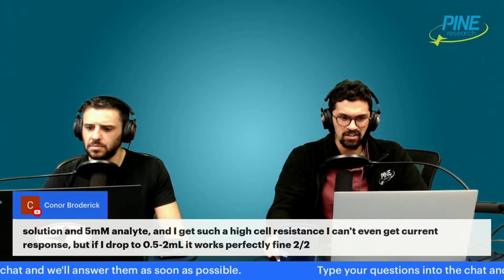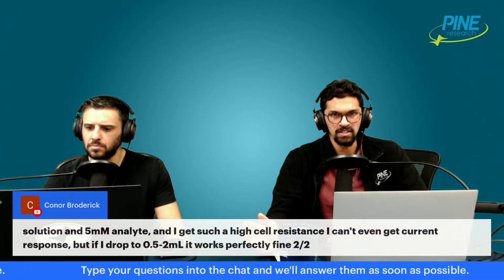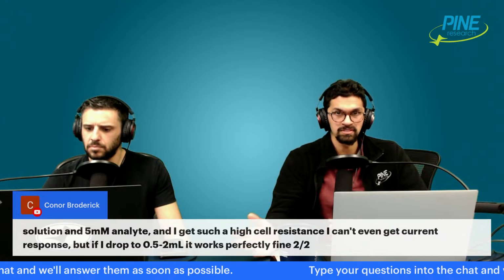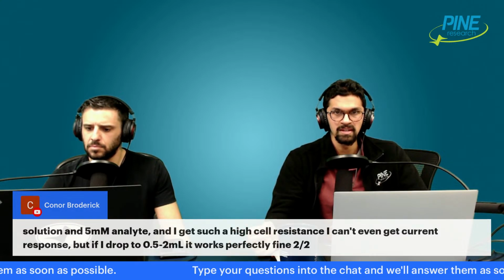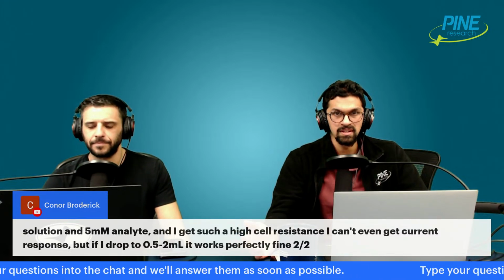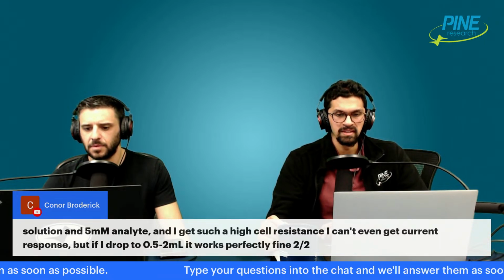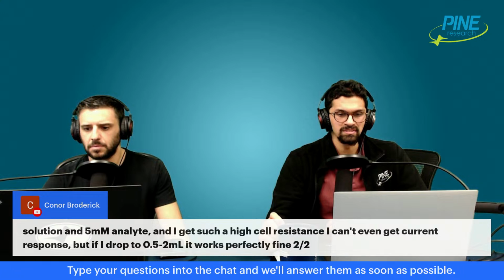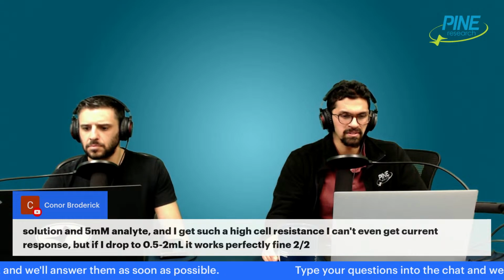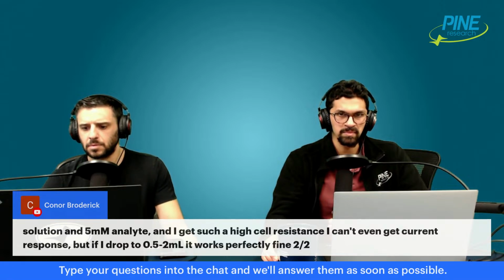This is definitely unusual. It's normally the case, as you said, that it's not even the volume of electrolyte, but really the thing that affects solution resistance most of the time in a standard 3 electrode CV system is the distance, if you will. You're looking at the resistance between the reference and the working electrode. That's usually part of it. The fact that you're not able to get the experiment to run in some cases, I don't know if that has another implication about the geometry of your electrochemical cell.